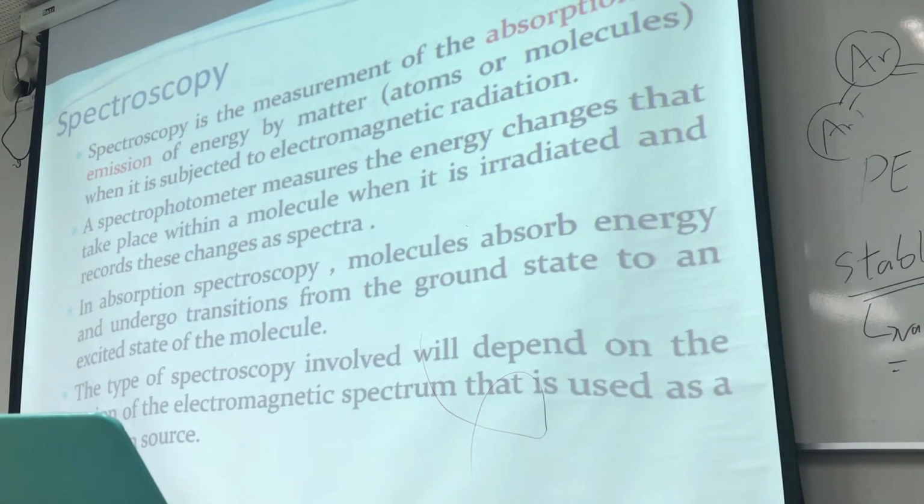The bond stays the same at certain frequencies, and at others the bond is changed. For example, if a C is bonded with another C, and the electromagnetic radiation is, say, infrared, I just come and hit the bond. What happens is the bond may be stretching, or rotating, and so on.